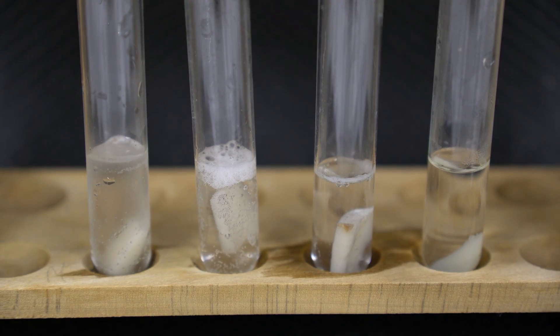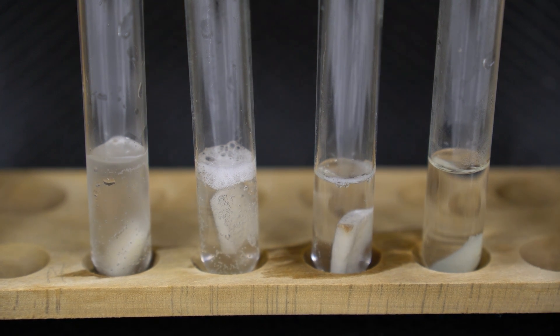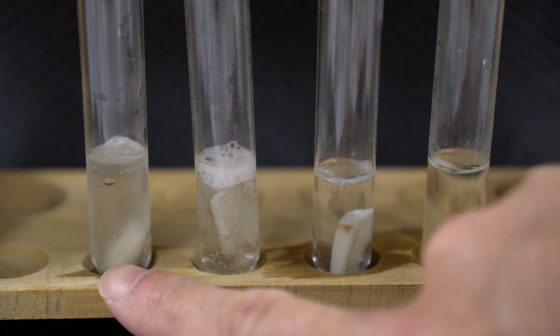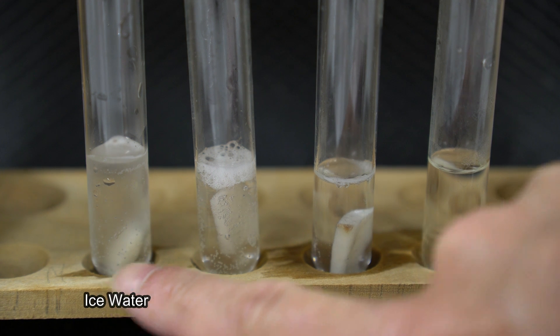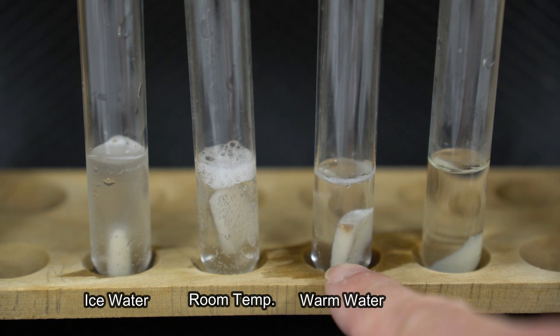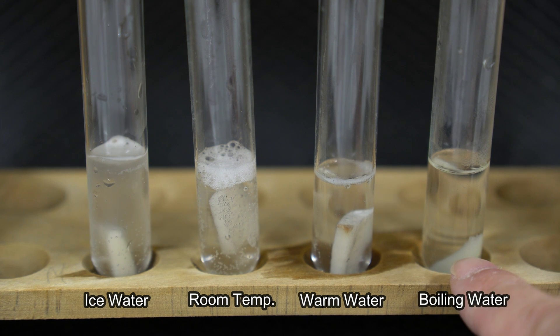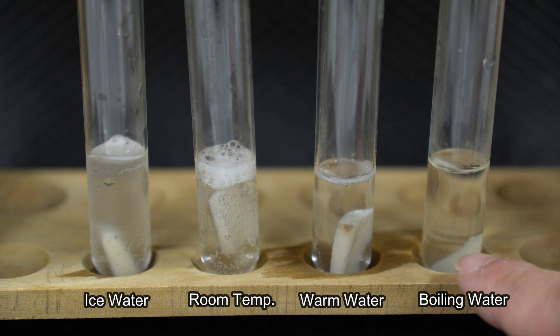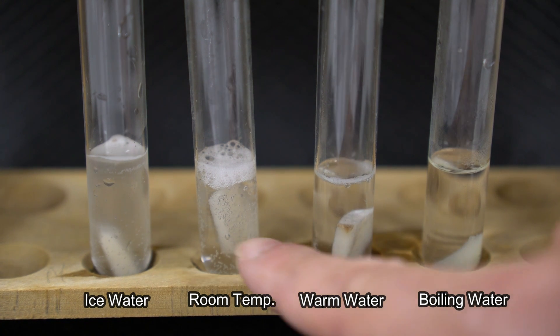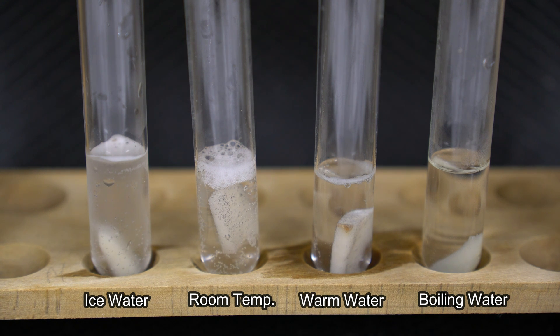Okay, so this shows the difference in temperature that everything was exposed to. Here we have hydrogen peroxide that was chilled in an ice water bath. This hydrogen peroxide was kept at room temperature. This was warmed in the warm water bath. And here the potato was left at boiling. So we have boiled potato, warmed potato, room temperature, and chilled potato with hydrogen peroxide.